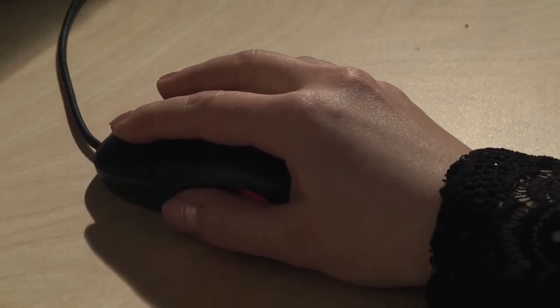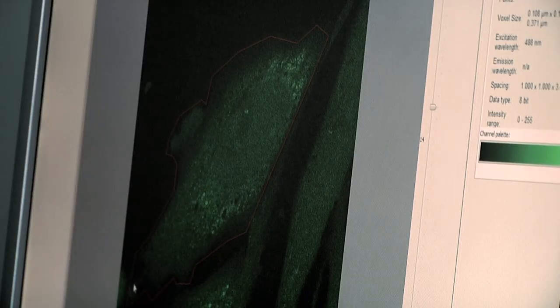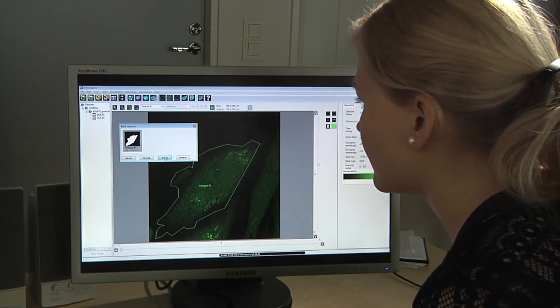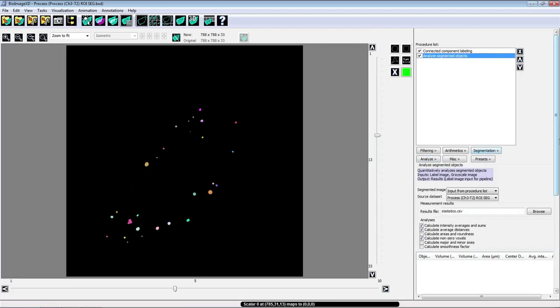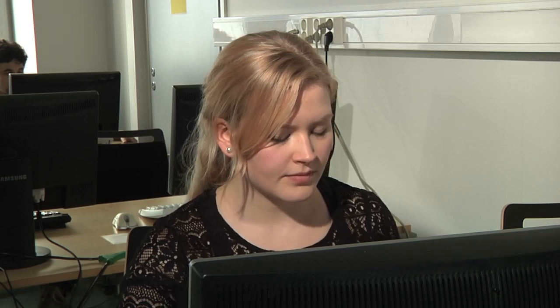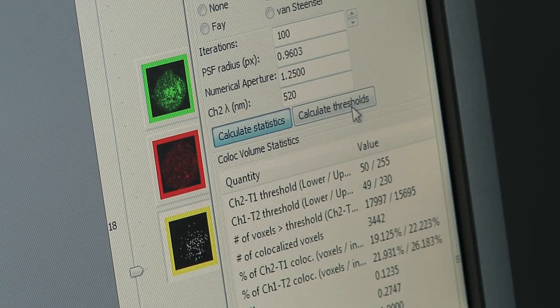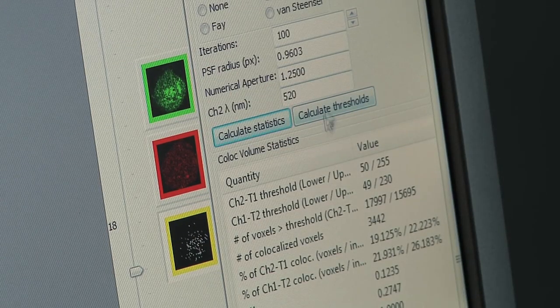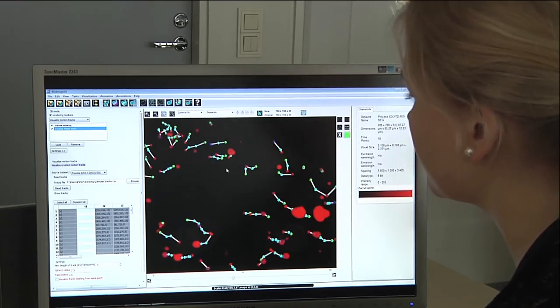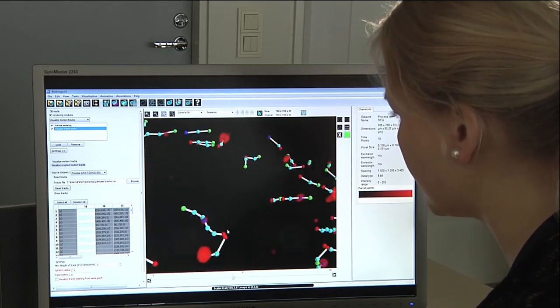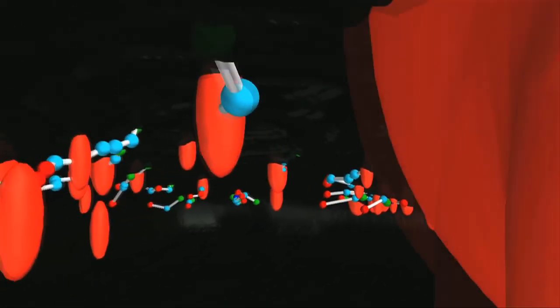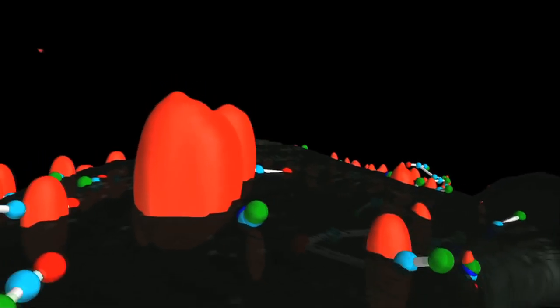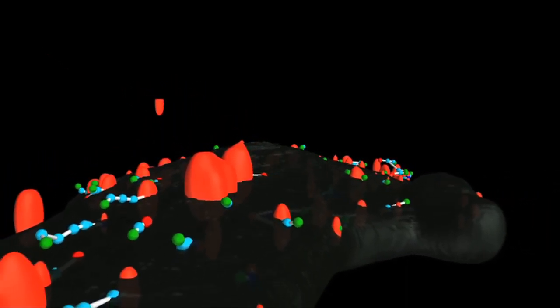BioImage XD includes numerous basic processing features such as noise reduction, registration and various segmentation methods. Advanced analysis functions include, for example, different colocalization analyses and three-dimensional motion tracking. BioImage XD can be used in high-throughput applications without any programming skills.